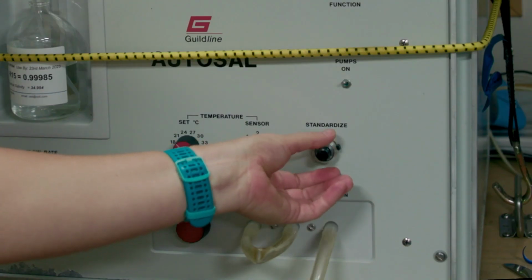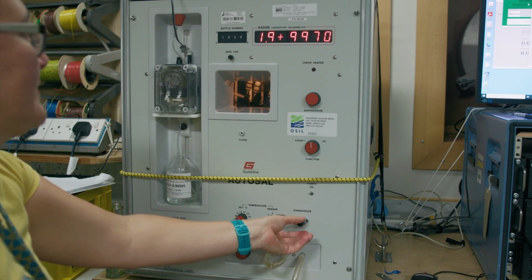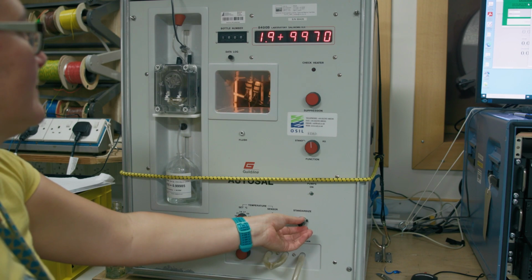Once your reading is stable, adjust the standardized knob so that the displayed value agrees with what is shown on the standard seawater vial. Again, for this instrument, the displayed value is twice the conductivity ratio, so for this batch, we're looking for 1.99970.